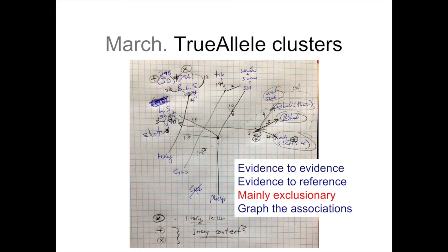We did some sensitivity studies. We think it's more likely another person, but there's no proof of that. It could just be an artifact. Whatever it is, it's not associated with the defendant. And it appears on all these evidence items which the police and their consultants and the prosecutors were not looking at. They're only looking at the fingernails instead of trying to get a sense of the whole picture.